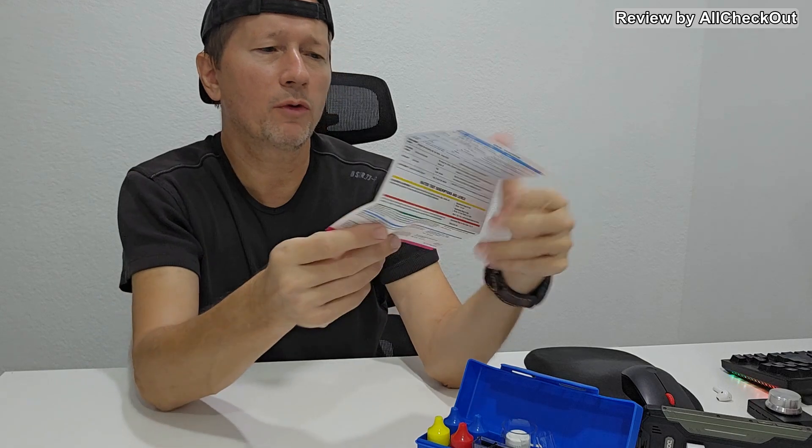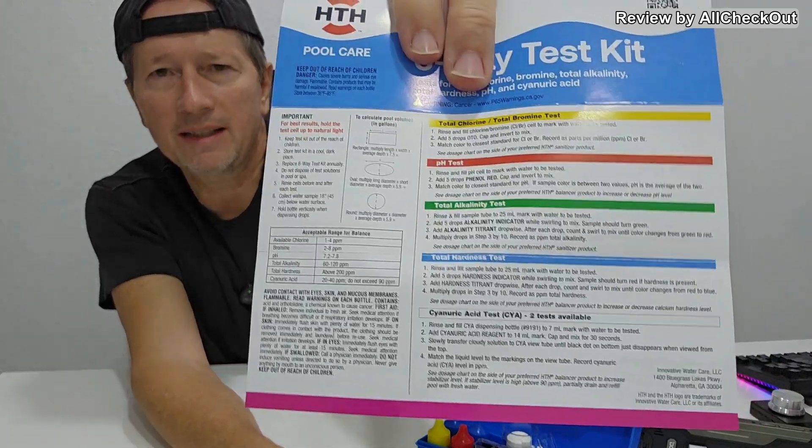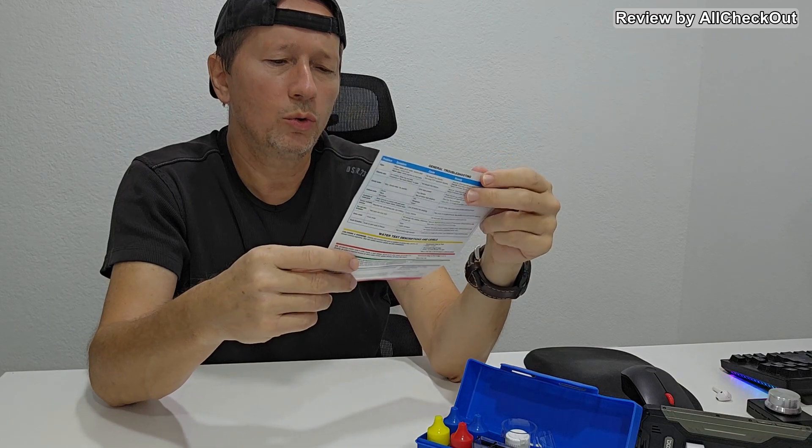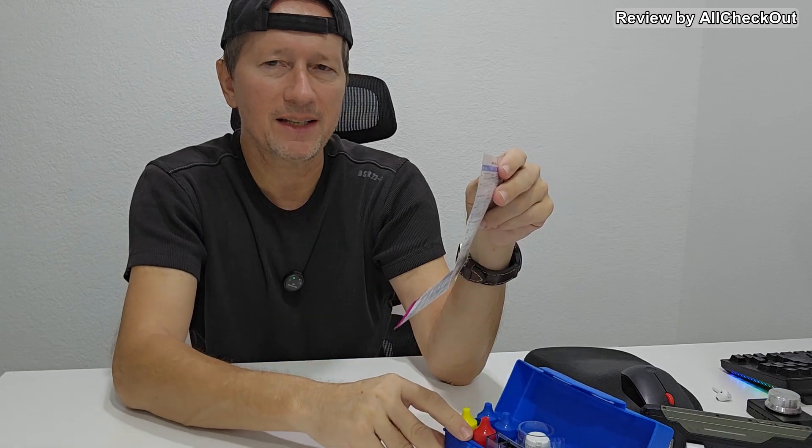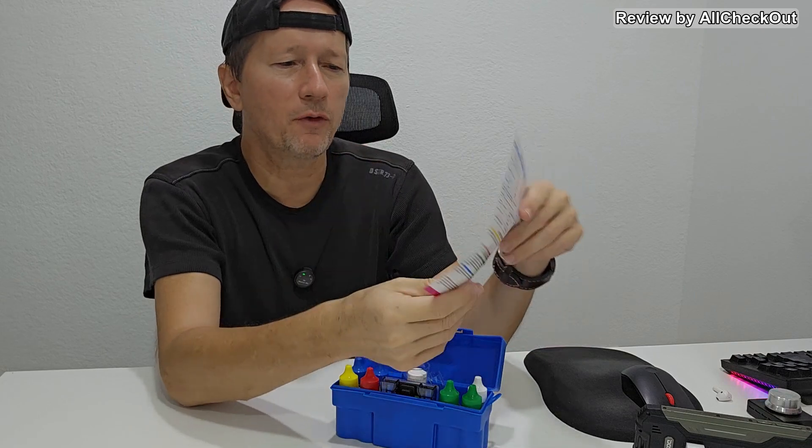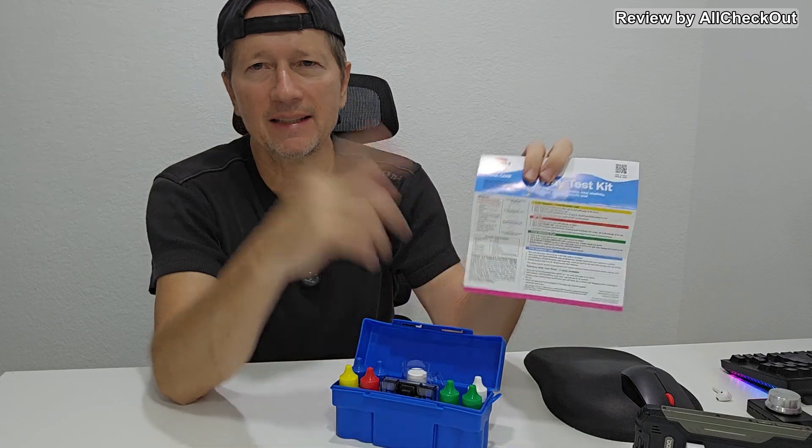The most important thing is on this side describing how to test it. It's not too difficult. We have dedicated stuff for each test here. In this video I'm not going to do all the tests - I'm focusing on the cyanuric acid test.